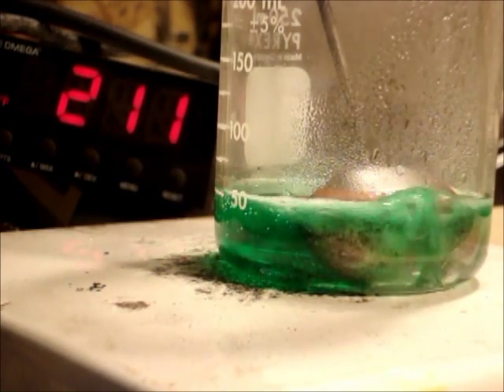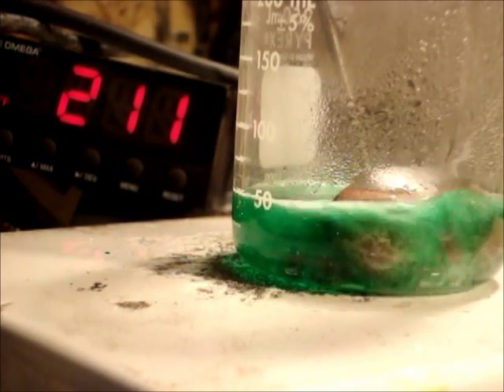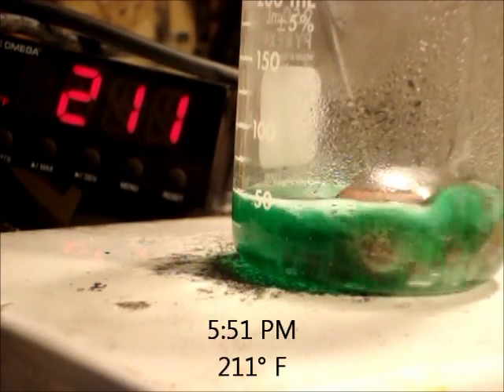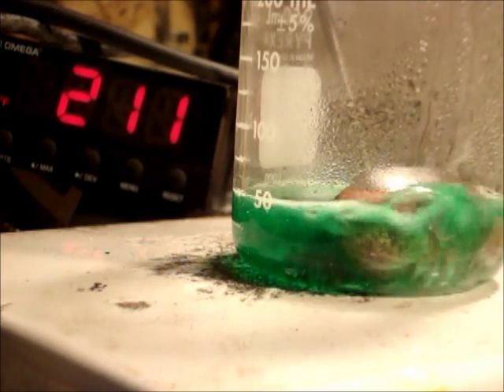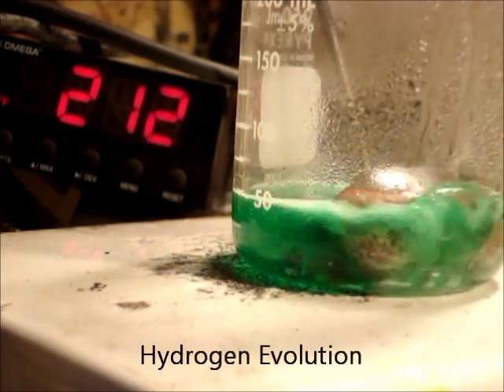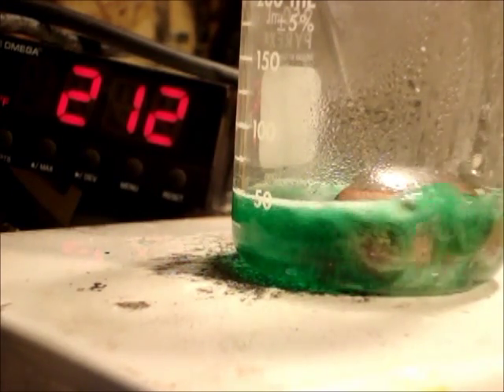And I think I might crank it down just a little bit here in a minute. Okay, it's 5:51, 211 degrees. And looks like we definitely got boiling of nitric acid plus hydrogen evolution. I think I'm going to crank down the temperature and see when the bubbles cease.